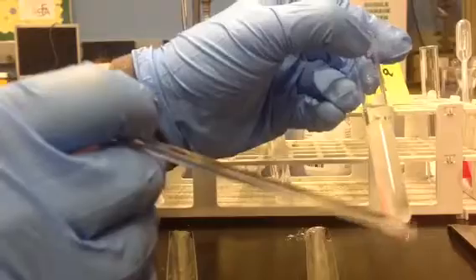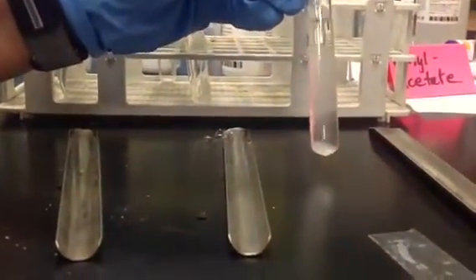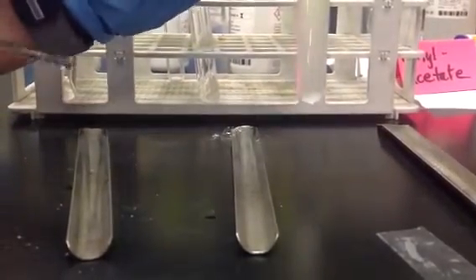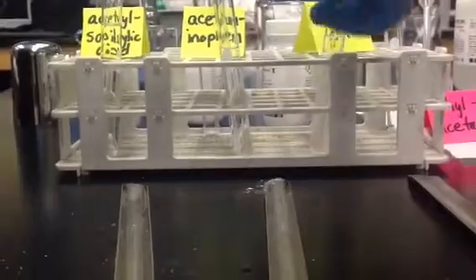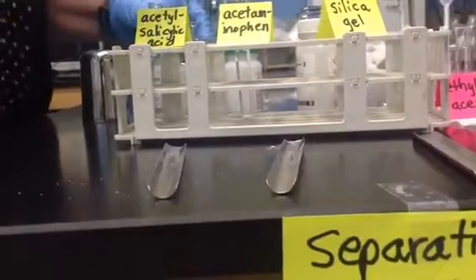And it's at the bottom of the test tube. So we have confirmed that the silica was not soluble in either water or ethyl acetate. So we're done with that part of the inquiry, introductory activity.